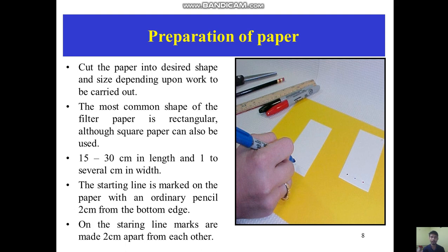The starting line is marked on the paper with an ordinary pencil, 2 cm from the bottom edge. This is because when we dip the paper in the mobile phase, it may dissolve the compound from the sample spot. So we need to spot the sample above the mobile phase level — it should not be dipped into the mobile phase in the tank. That is why we make the starting line above 2 cm.